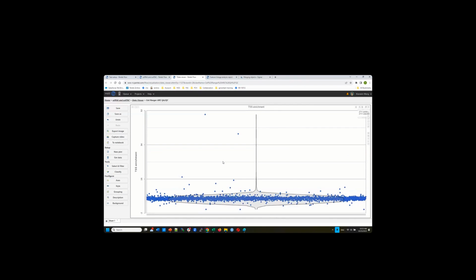They calculate the ends of these TSS flanking regions and use that as a background to calculate the ratio. And here, the higher the better. Low means you don't have enrichment in your TSS region, so you want it higher. But still, if it's too high, that could be a doublet. You want to look at your data to determine your filter.